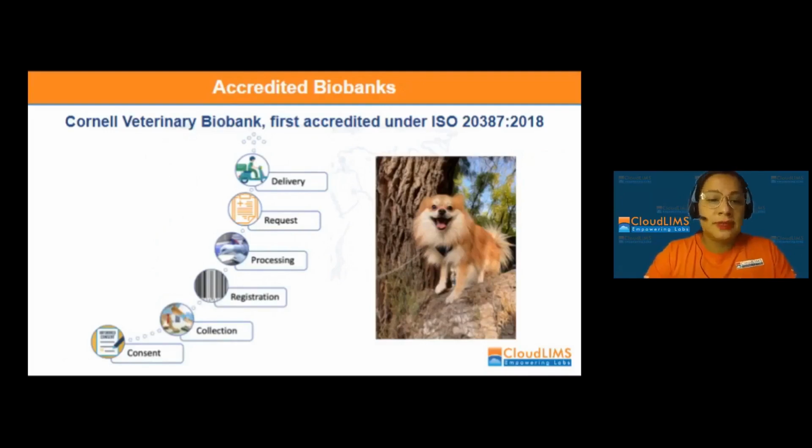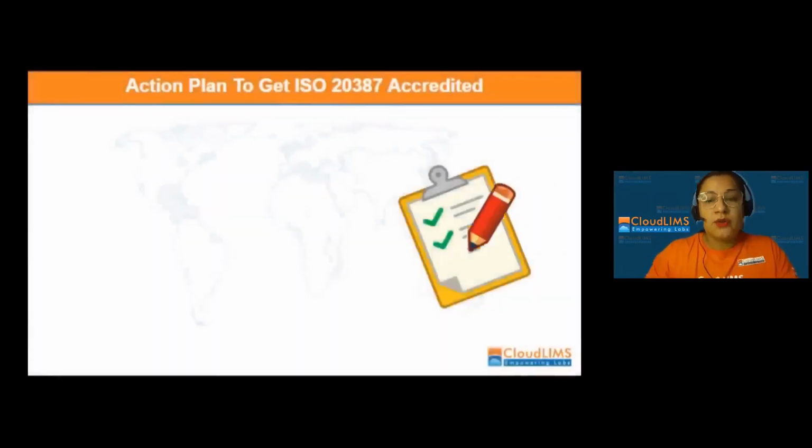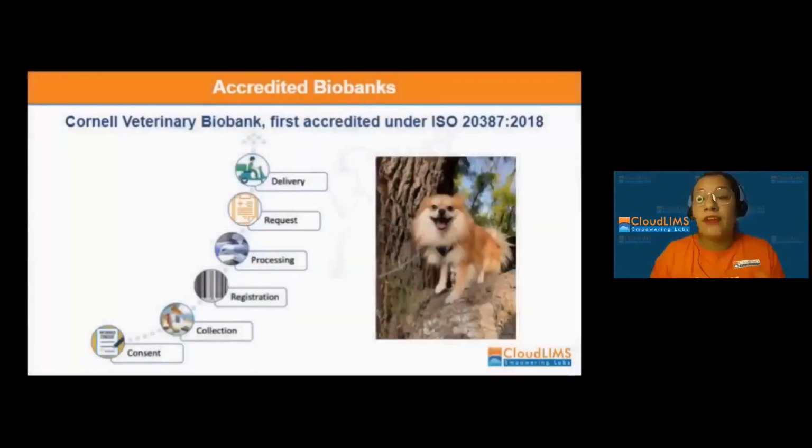Then they process the samples, then they may receive a request for evaluation, they do the request preparation, and then they deliver the samples. And well, quality management is essential in the maintenance and operation of a biobank. The biobank should be able to track each biospecimen, as this helps to manage the sample quality and the effective use of the sample in the future. So the quality systems should involve protocols, SOPs, verification, staff education, and training. A good quality management plan can lead to higher quality samples and reproducible research results. That is the main goal in your biobank.